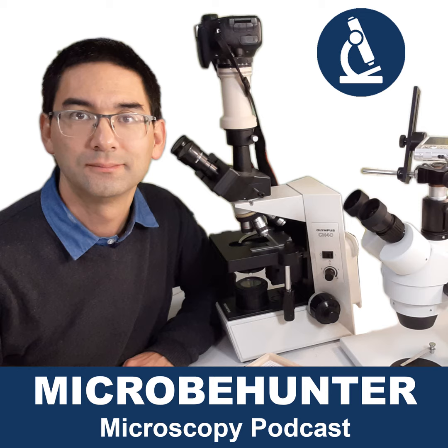But the real question is now, what magnification do I need? Or is 1,000 times already enough? Or can I already see, I don't know, ciliates, water life, bacteria with, let's say, 400 times? Or what do I need?